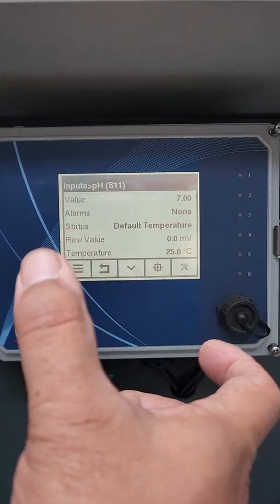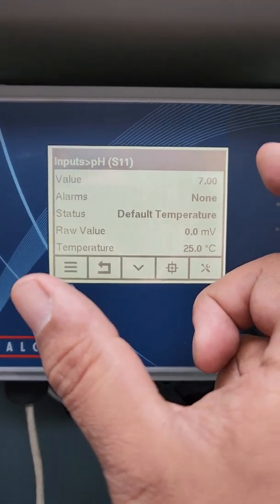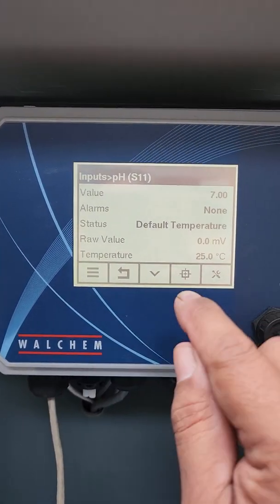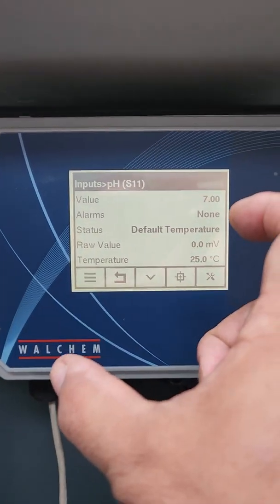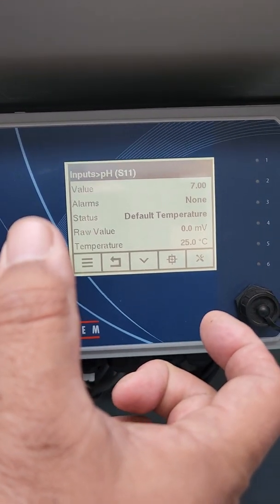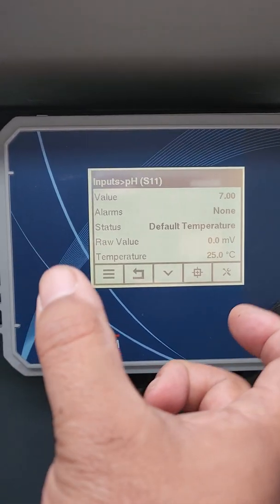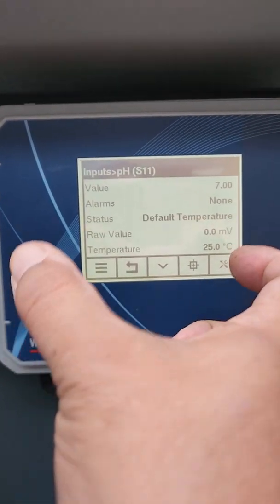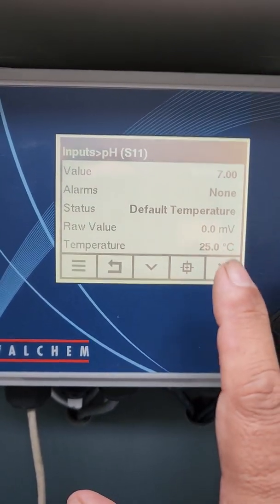Obviously, the bigger that percentage, the more this probe is on its way out, requiring replacement. So when you see those differential numbers on the calibration side get bigger, that's when you know, hey, look, it's getting harder for this thing to bring it back to what is right, and there will come a stage where it just can't bring it all the way back and goes boom, failure, fail to calibrate, get a new probe. But that's what's going on in the background.